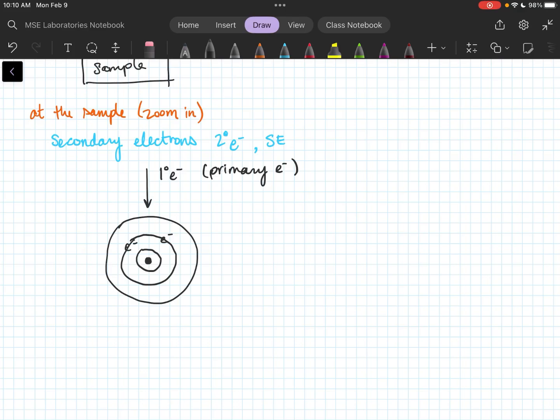And this atom has electrons traveling around it. It's got some on the inside, some on the outside. Which of these electrons is the most solidly attached to the atom? The closest, exactly. The outside ones are less well attached, and the middle ones are middle.